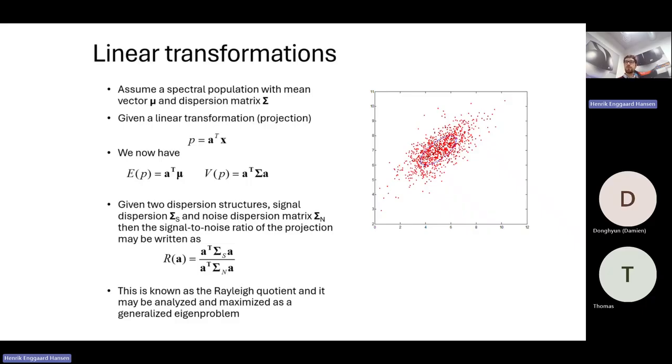With RGB images, we would have 3. With multi-spectral images, we could have 48 or more. But we want to condense that down to one dimension that just tells us whether something is good or bad, or close or distant.